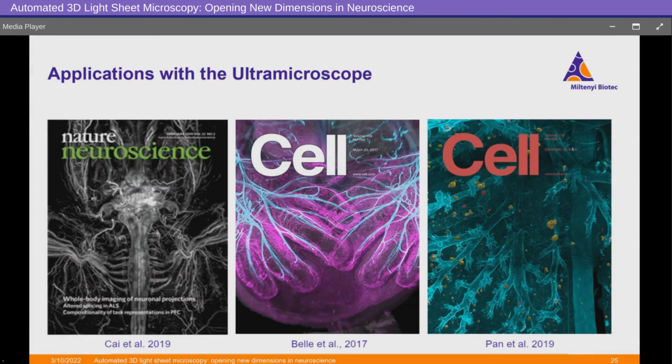We are now moving into the last portion of my talk, where I will review some neuroscience-based applications using the UltraMicroscope, but of course there's potential for much more than what I will show you here. I hope that you feel free to reach out to me. I'll provide my contact information at the end of this presentation, or you can join us at the booth afterwards if you want to discuss ways of enhancing your research projects by incorporating light sheet microscopy.